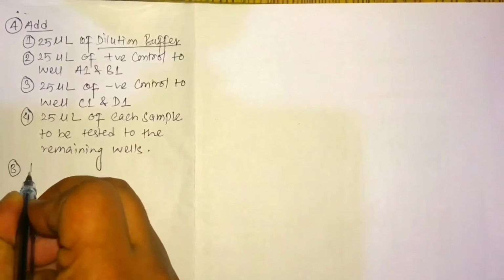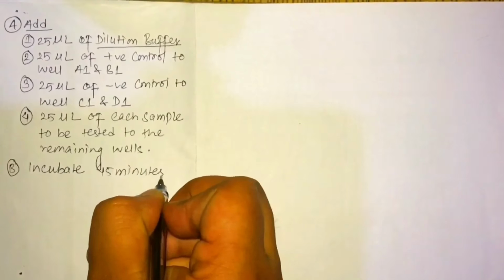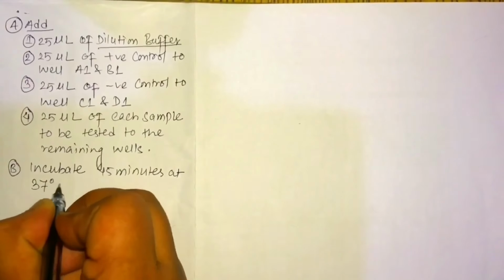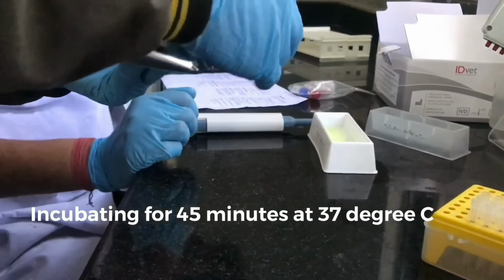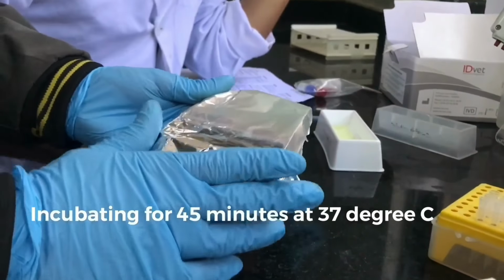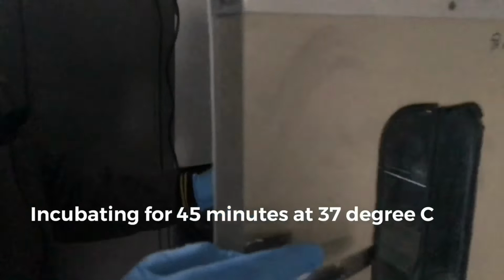Now we will be incubating the plate for 45 minutes at 37 degrees Celsius. Just covering it with aluminum foil and keeping it in the incubator for 45 minutes at 37 degrees Celsius.